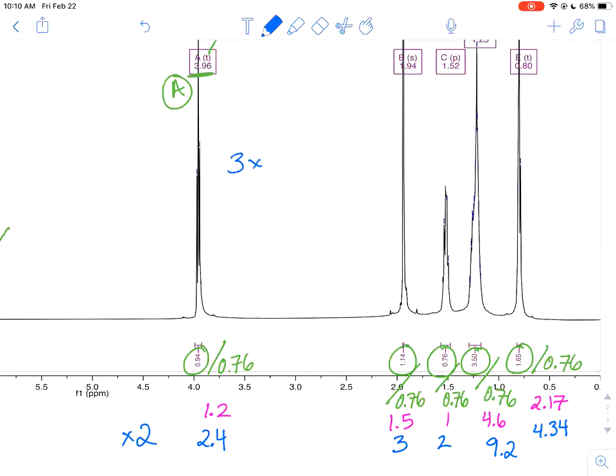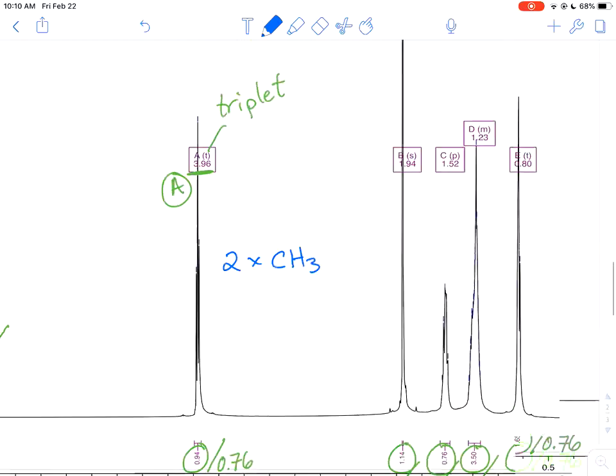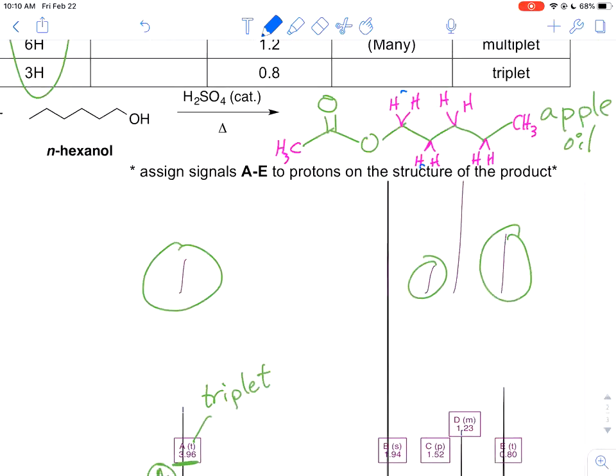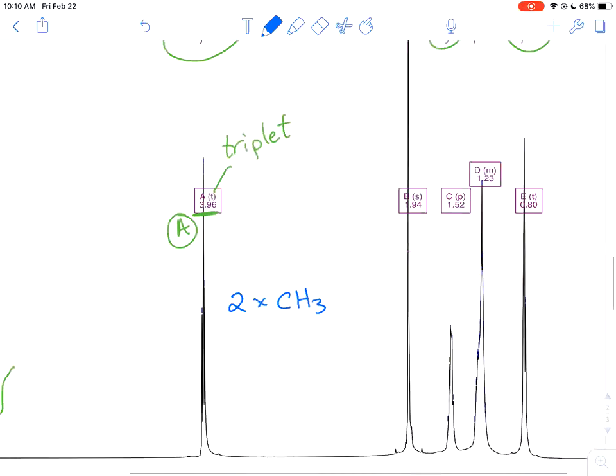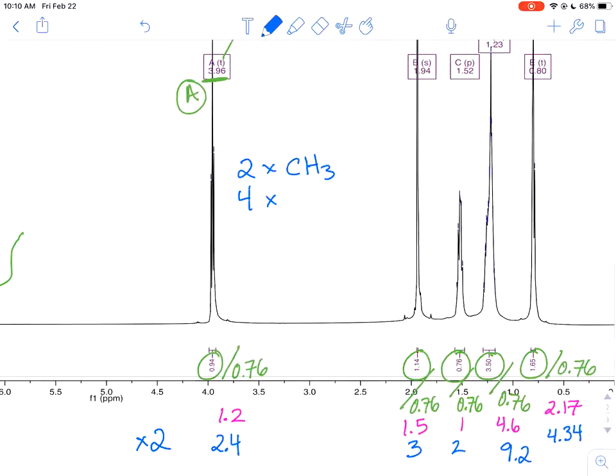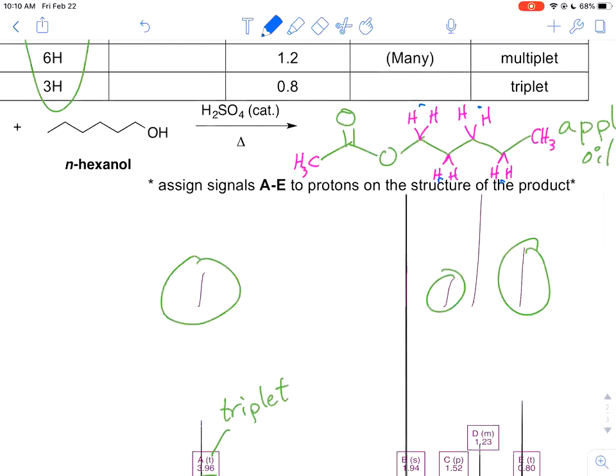So we're looking for, just a kind of recap, there in theory should be two CH3 signals. And then I believe four CH2s. And of those two methyl groups, we have one that should be a singlet. This guy here should be a singlet. This guy over here should be a triplet. It has two neighboring protons, both of those guys on that carbon there.